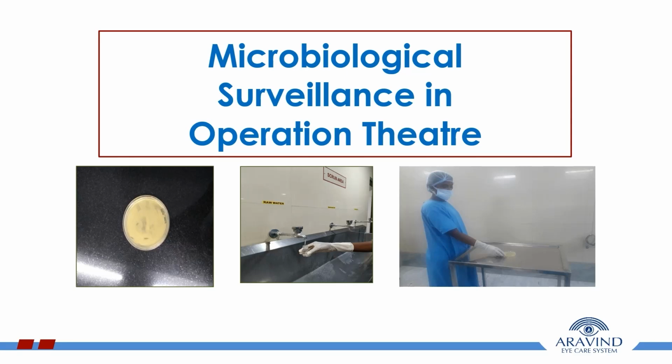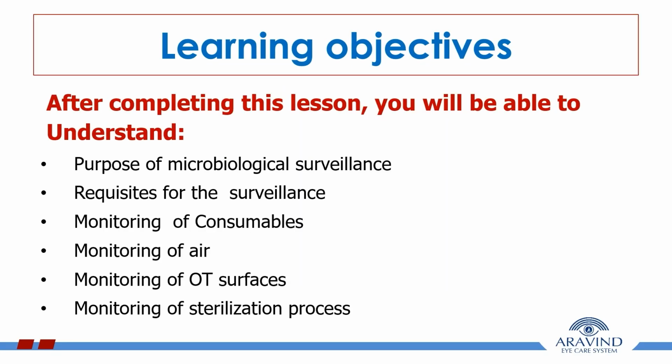Microbiological surveillance in Operation Theatre. Today's learning objectives. After completing this lesson, you will be able to understand the purpose of microbiological surveillance, requisites for the surveillance, monitoring of consumables, monitoring of air, monitoring of OT surfaces, and monitoring of the sterilization process.